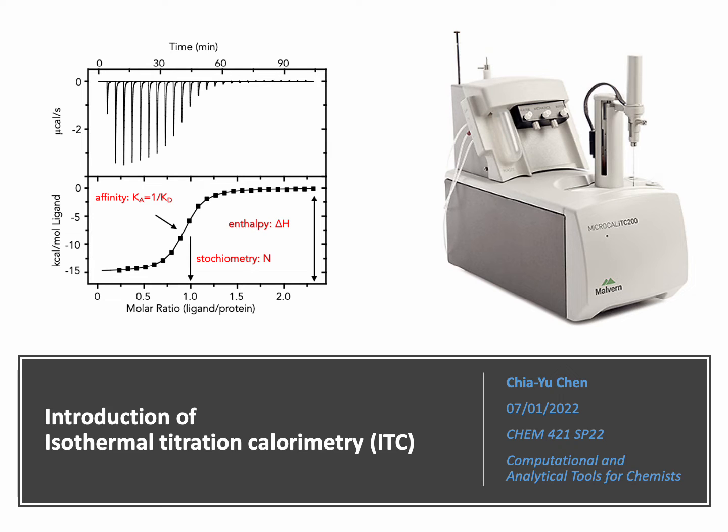Hello, I'm Chia-Yu. Today I would like to share with you a very powerful analytical technique called isothermal titration calorimetry, also simplified as ITC. Hope after this short video you could briefly understand how it works and how to analyze the ITC data.